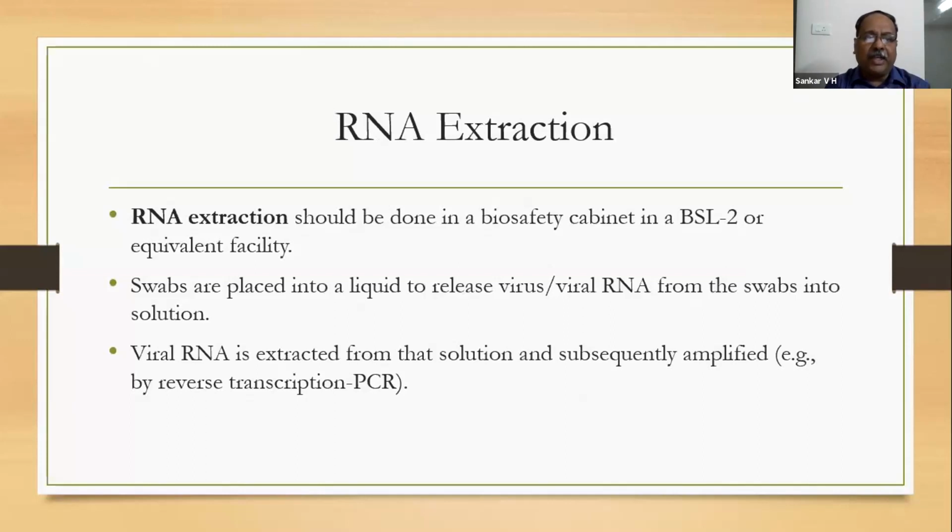So a PPE kit and all safety precautions have to be taken, and it should be done in a biosafety cabinet with negative pressure so that it does not reach the person doing it. The lab should have BSL-2 or above facility. That is the standardization of the lab, where there is a significant facility to prevent infection.